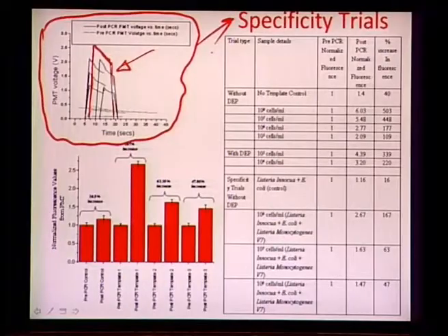So, the essence of a multiplex assay is basically to design a specific primer sequence to pick up one particular cell. Therefore, if the primer is supposed to amplify, let us say, a 385 base pair long region of a particular cell, the signal should only come because of this amplification and not something which goes unnoticed, which is non-specific in nature.